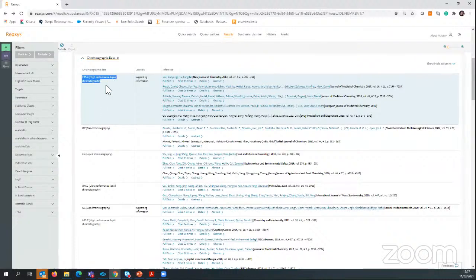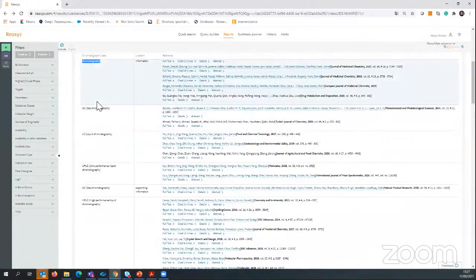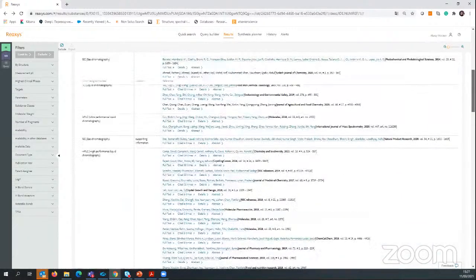Of course, sometimes HPLC methods are very complex, and in this case you will need the full text of the article or the document explaining the analytical method, but at least you can easily find the links to the article, and also understand which kind of chromatography was used for analysis.